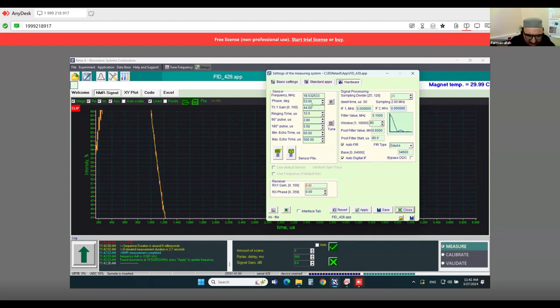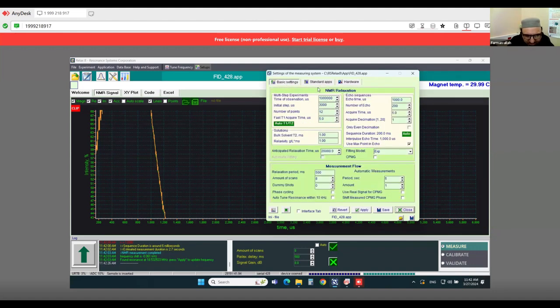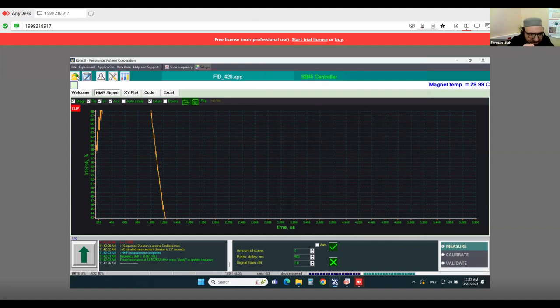So the difference may be due to the sample, but it's not too much. This is 0.00 something. We will see randomly that it is not so far away from the zero line.